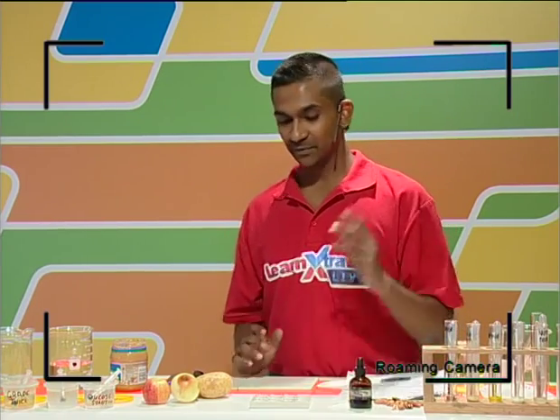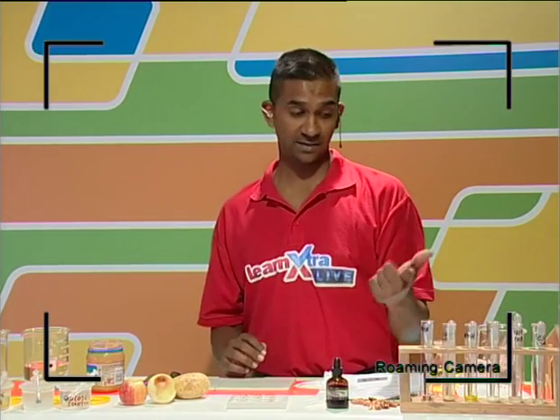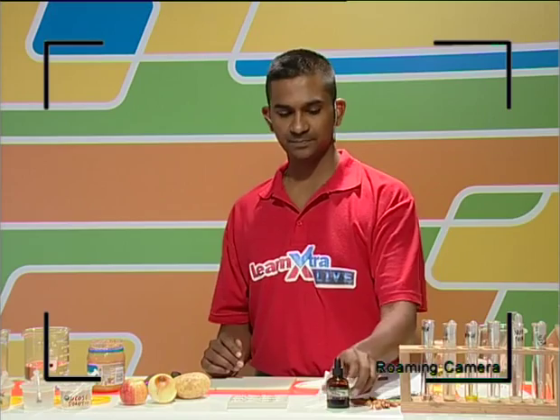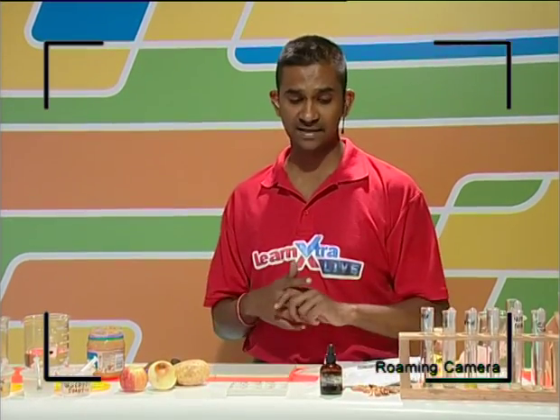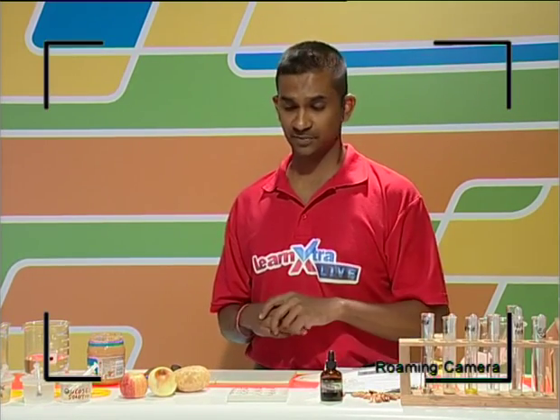Okay, so we looked at the test. We looked at the results from there, and we looked at the emulsification of fats. So we looked at watermarks or the oil stains there. The last test we're going to look at today is the starch test, and the indicator we're using is iodine. And iodine is a chemical indicator found in most labs, and that's the standard indicator for testing for the presence of starch.